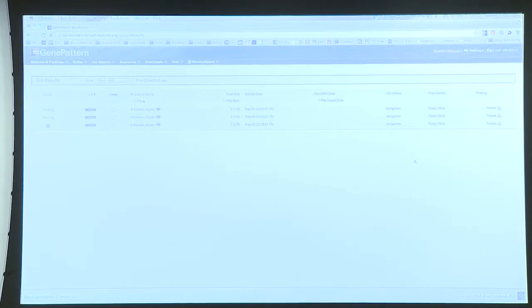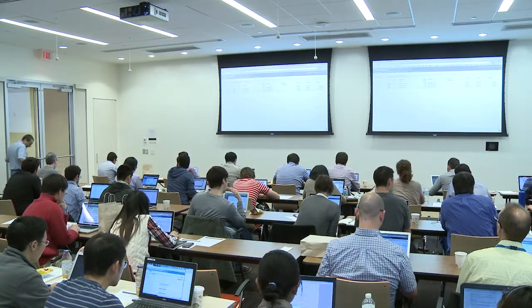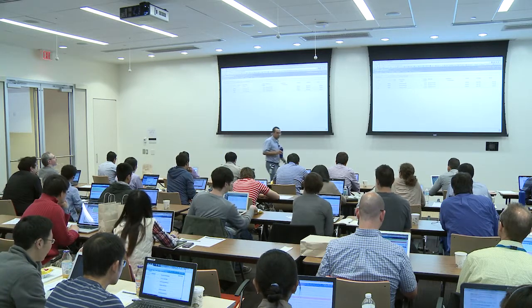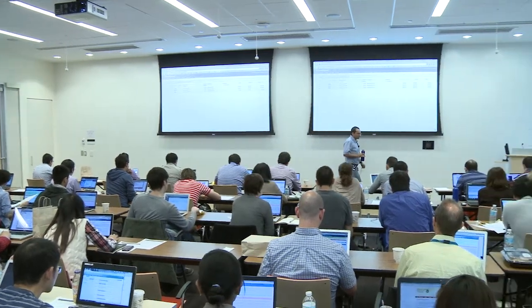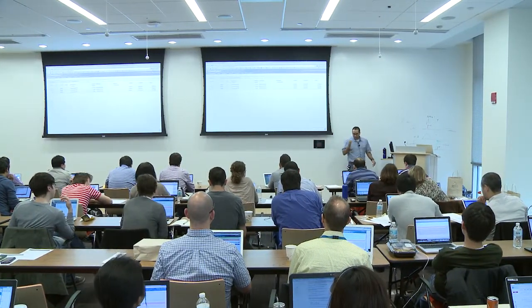And now they're running. So sometimes it takes like 5 minutes. Sometimes it takes shorter. I think it might take a bit longer because I guess all of you are going to do it now. Yeah. So one point that I realized was not clear enough, and we'll see it later when you get to the IGV, is the idea of the whole cell extract or control.